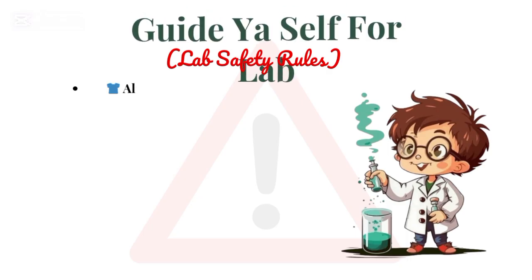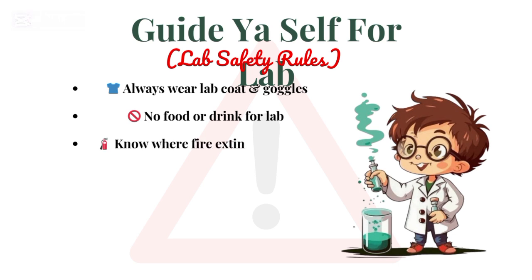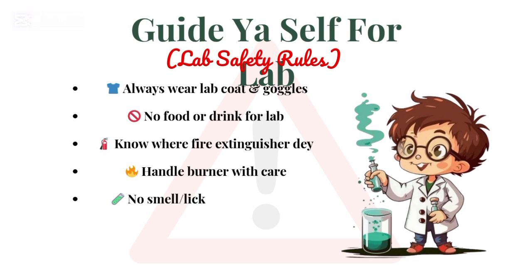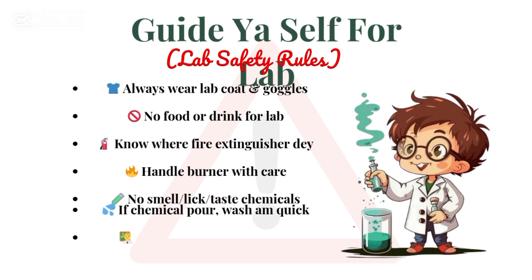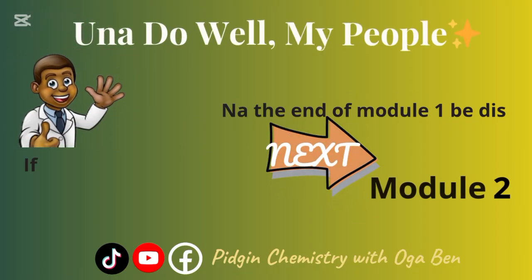Listen, may I tell you, lab no be place where you go enter, go dey play, and no be playground. Na place where you need to dey very careful, because any mistake fit injure you and injure other people. Na make we get these rules to help you dey safe. Always wear your lab coat and your goggles when you enter lab. No chop or drink for lab. Know where fire extinguisher dey in case fire happen. Handle anything wey hot with care. No smell, no lick or taste any chemical. If chemical pour for your body, wash am quick. Always follow instruction and make sure say every container wey you dey use get label. Yowa, na so Hausa man talk am.